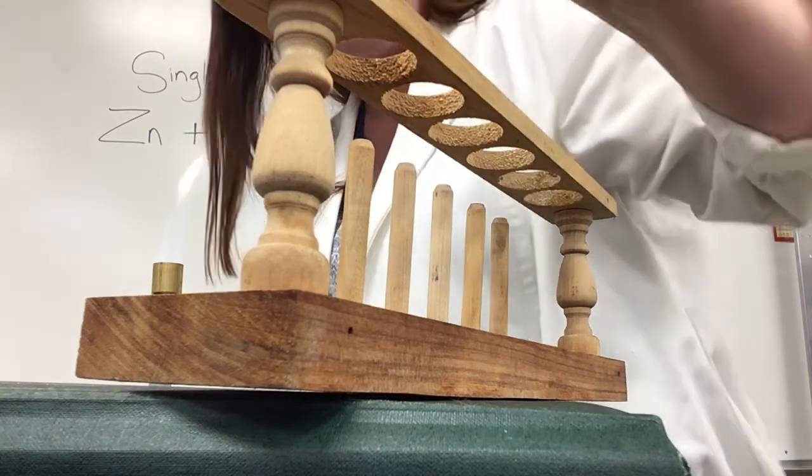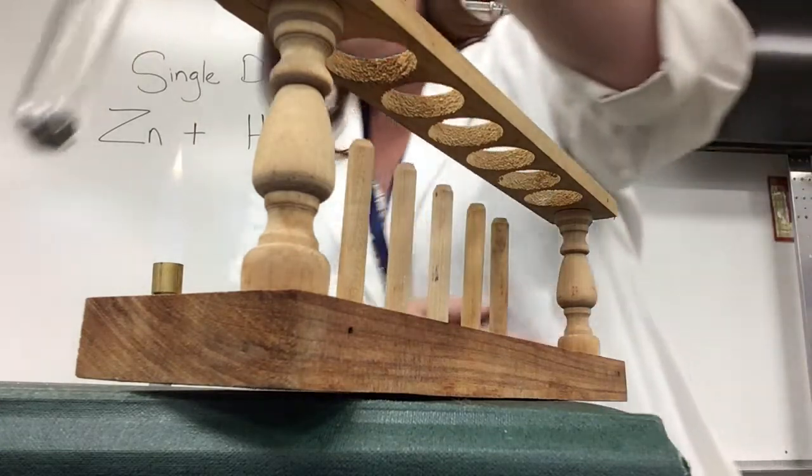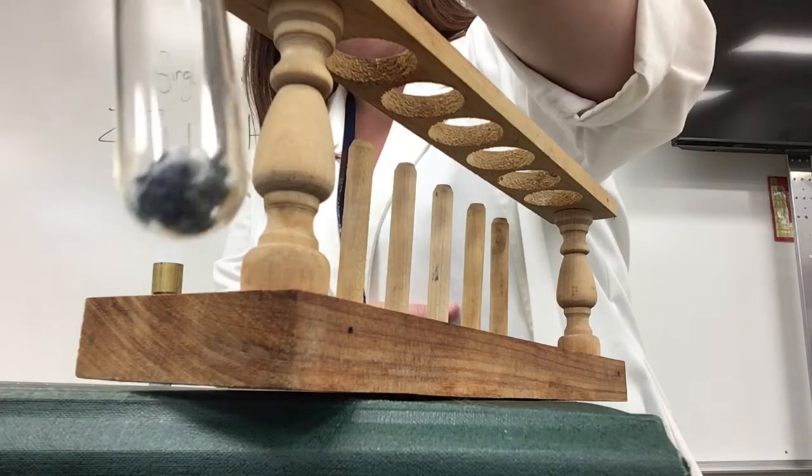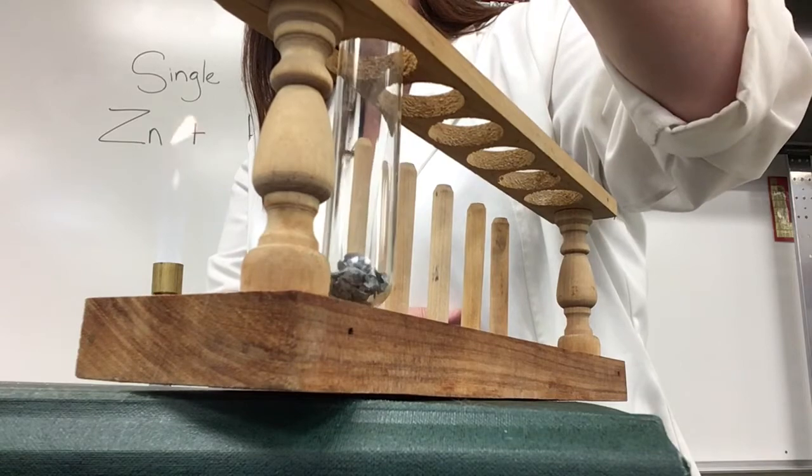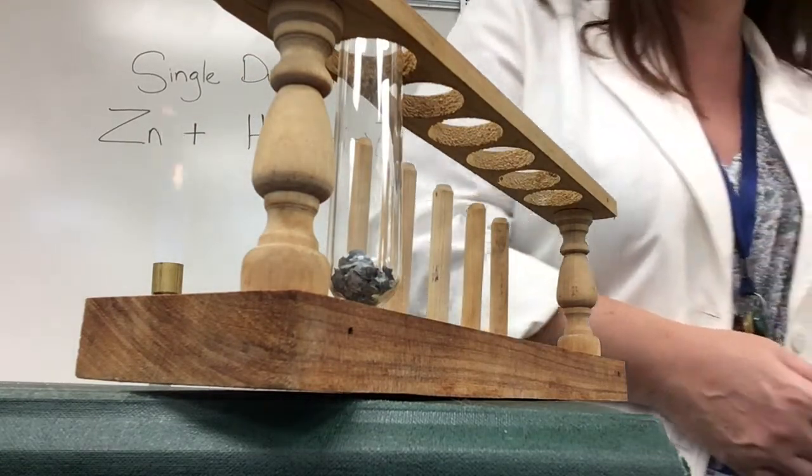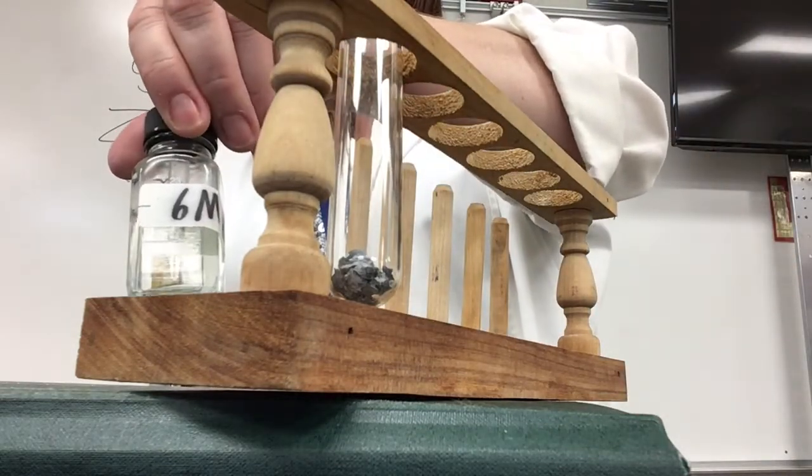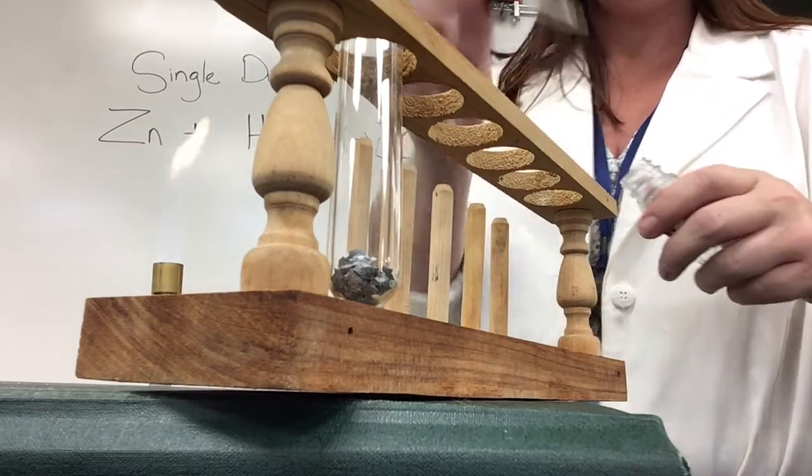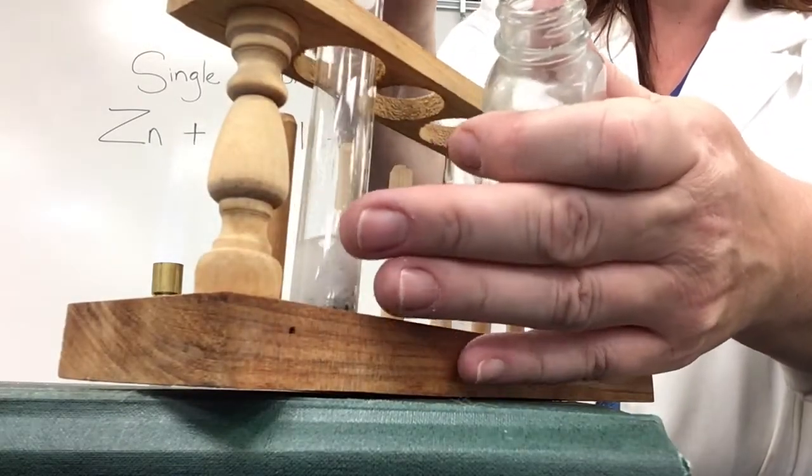So we're going to put a little bit of this mossy zinc into our test tube like so, and I'm actually going to add an acid to this. So I'm going to put it in my holder there while I get my acid. The acid that we're using is HCl, that is hydrochloric acid. This is a six molar concentration so it's going to be pretty strong. I'll put several squirts and I can see that it's already starting to bubble.